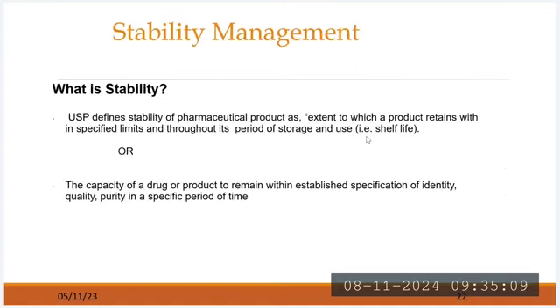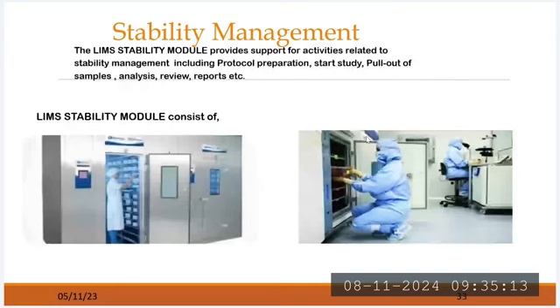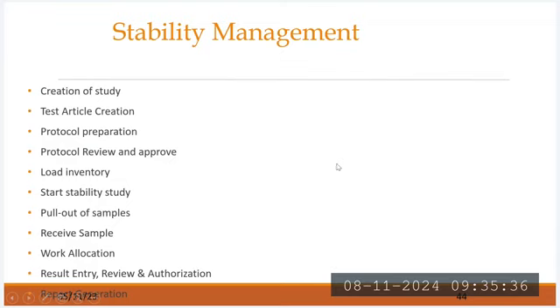If I go through some of the screenshots, the way I have discussed, it was presenting on the screen the way I am representing on the system. Some physical activities need to be done in some places, like loading. When I click load on the system, the system is not going to load. Physically, I have to go there and place the samples. These are the steps I need to follow manually.